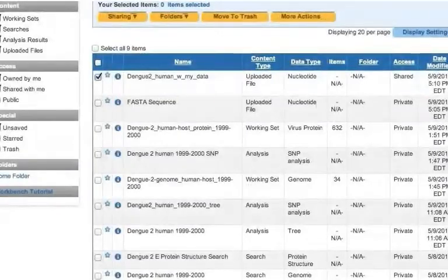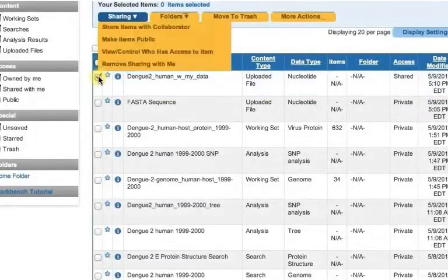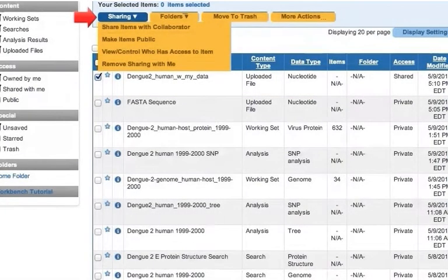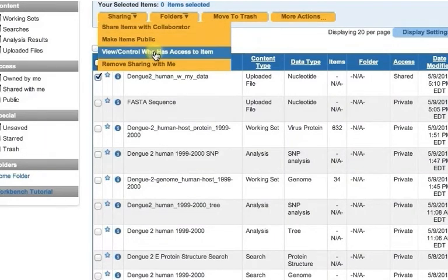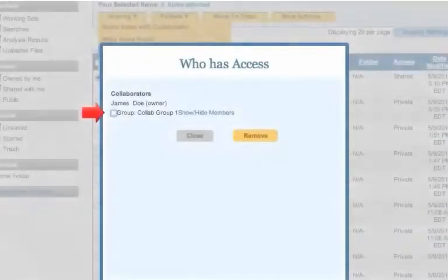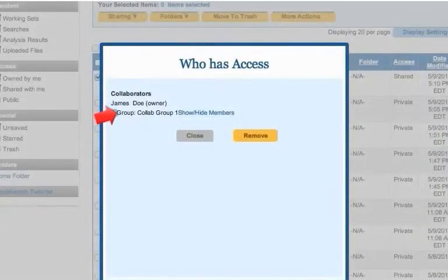If you would like to change who has access to view a previously shared workbench item, mouse over the Sharing button above the main workbench table and click on the View Control who has access to item option. Choose a collaborator that you no longer want to have access and click the Remove button.